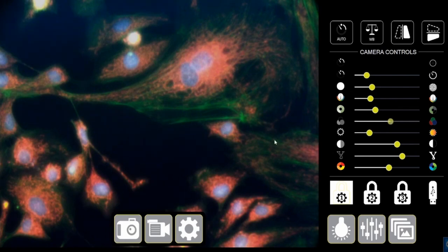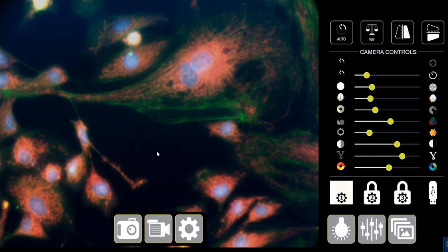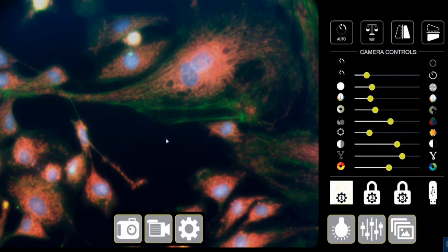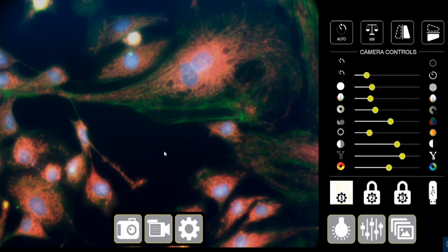You can just hit the button and click button and that's it. There you go. You have a live color image. So you can keep scrolling and scanning and get to different areas of interest, take pictures all the way, and then do your research.